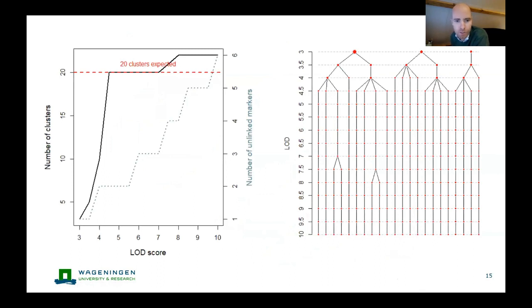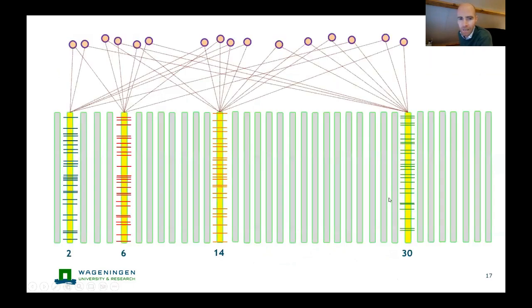There are various visualizations provided in order to figure out at what sort of a LOD score you should split up your data. And then usually we use duplex, nullplex markers to associate those clusters back together to find our chromosomes, because a duplex marker will be linked to markers on multiple of these phased haplotypes. So these homolog clusters, at this stage, there's no order inherent. These look as if they've been ordered, but they're not. They're just bunches of markers.